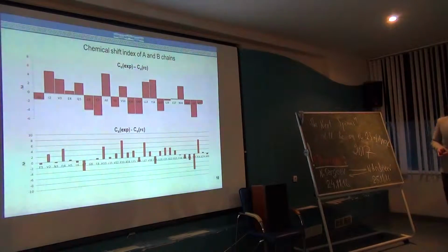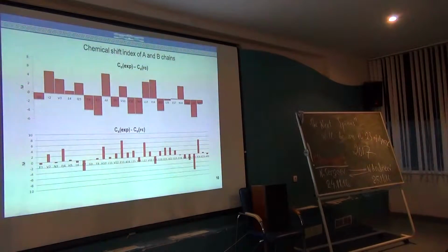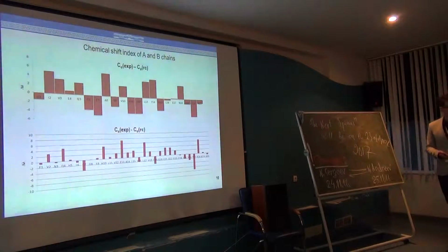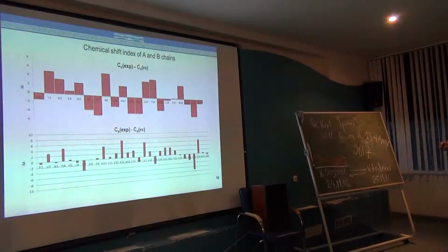Additionally, if the deviation is negative and goes through 3 or more residues too, we can predict a beta sheet formation. But in the case of insulin, it may indicate an oligomerization of insulin. It's what is written in some articles. And to check this, we must detect a diffusion coefficient dependence on concentration.